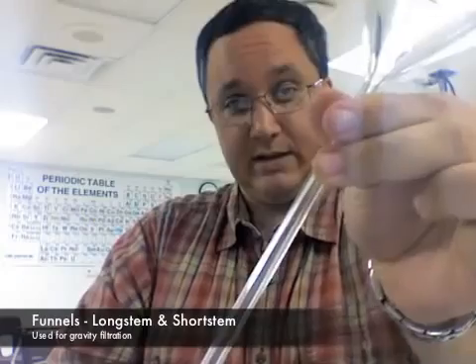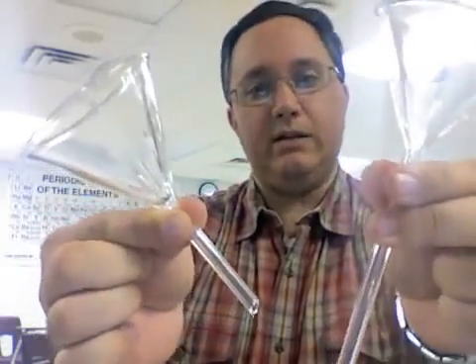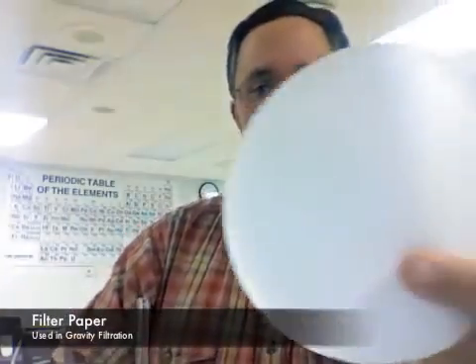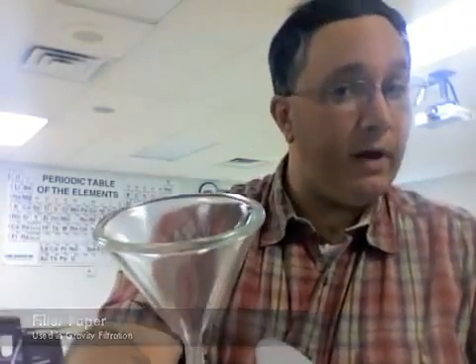Okay, next are funnels. Funnels can come in long stem. Funnels can come in short stem. Long stem, short stem. Funnels. We use funnels to funnel liquids from a larger container into a smaller container, and oftentimes we will use filter paper. The filter paper we'll fold up and put inside the funnel, and then pour the liquid through the funnel and have a clear liquid.